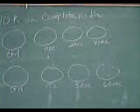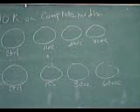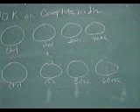And so the biggest part of the lab is trying to get 10,000 cells on your plates. So some of you remember doing this.